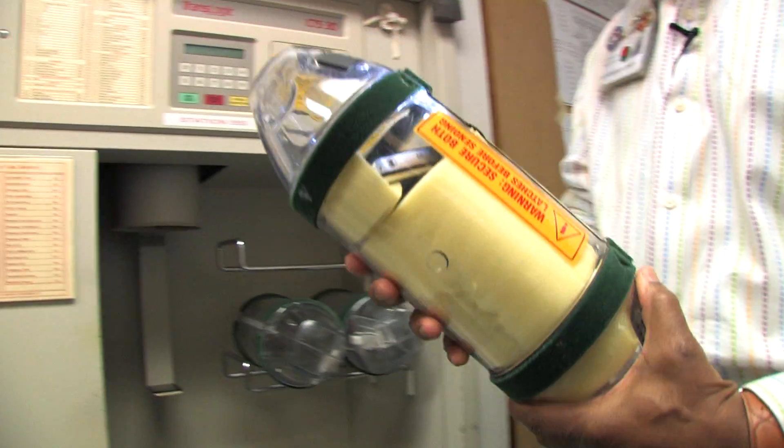We send things from blood to medicine, specimens - a lot of testing is really dependent upon the tube system.